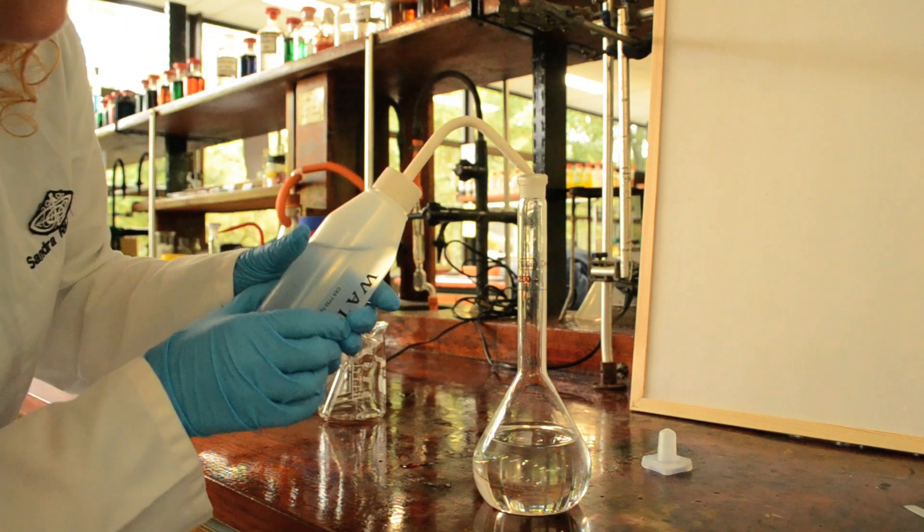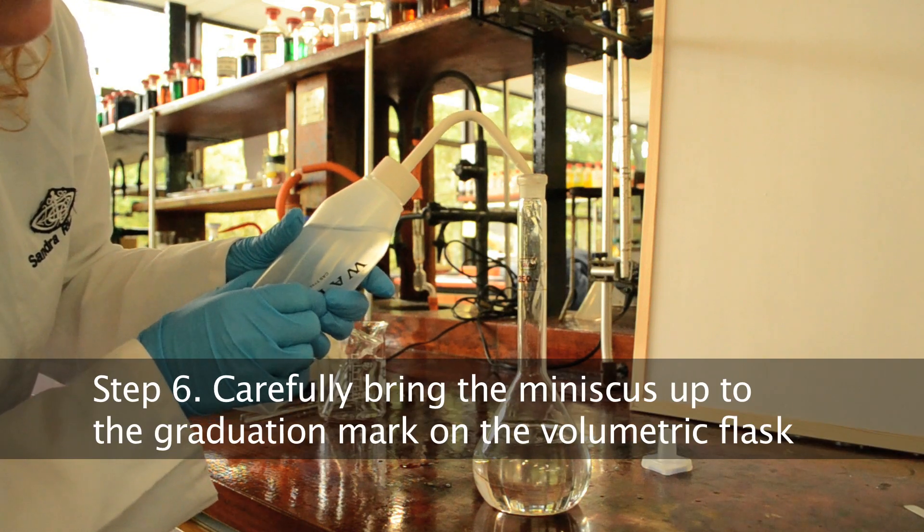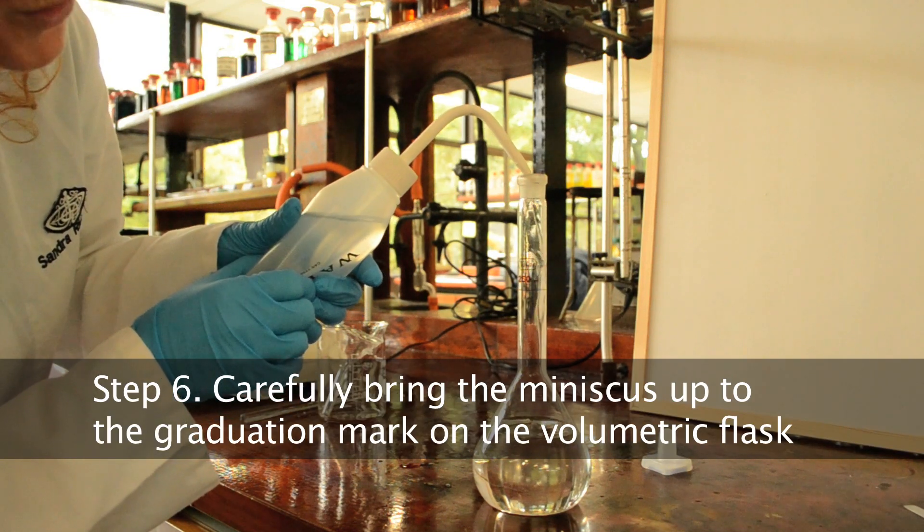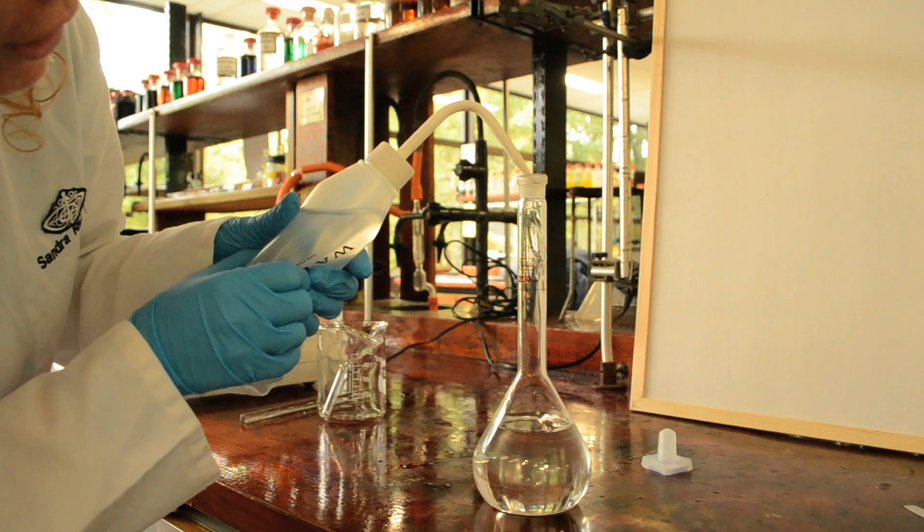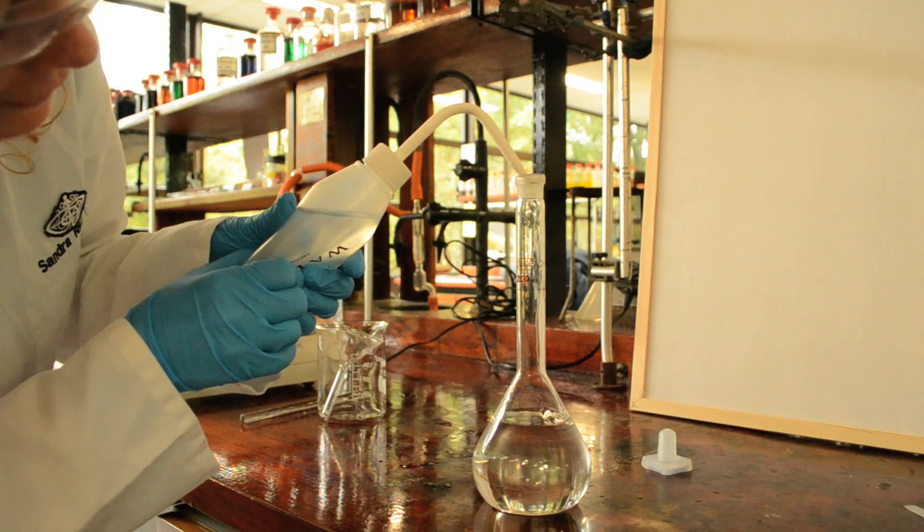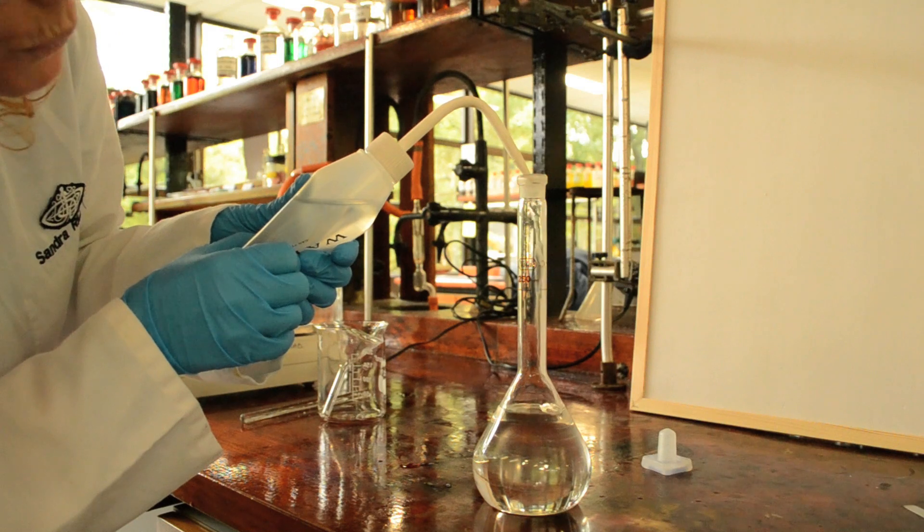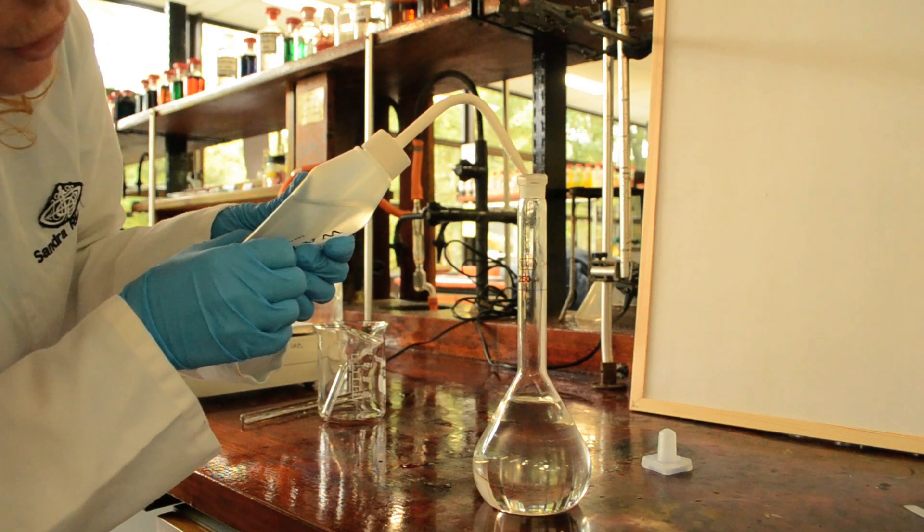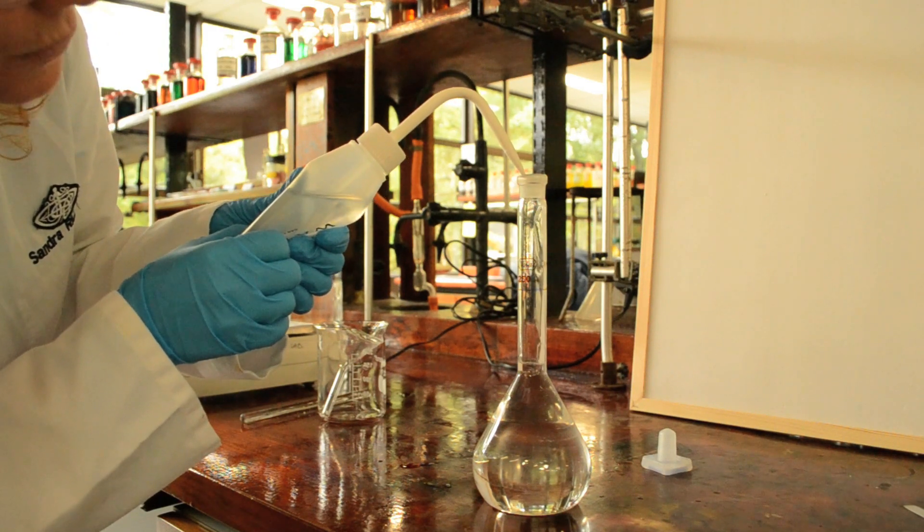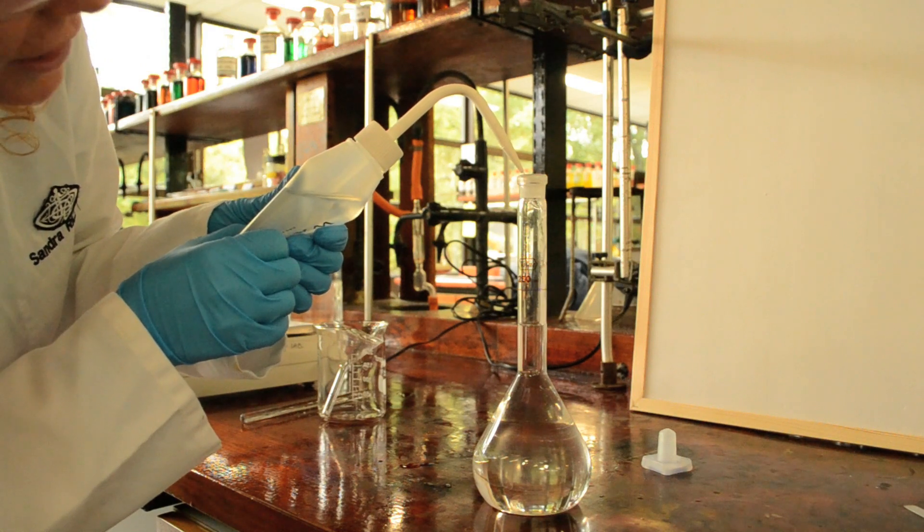Now I will top up the volumetric flask with deionized water, up to within about 1 cm of the graduation mark. The reason I'm using deionized water is because tap water can contain some contaminants which may interfere with our titration later.